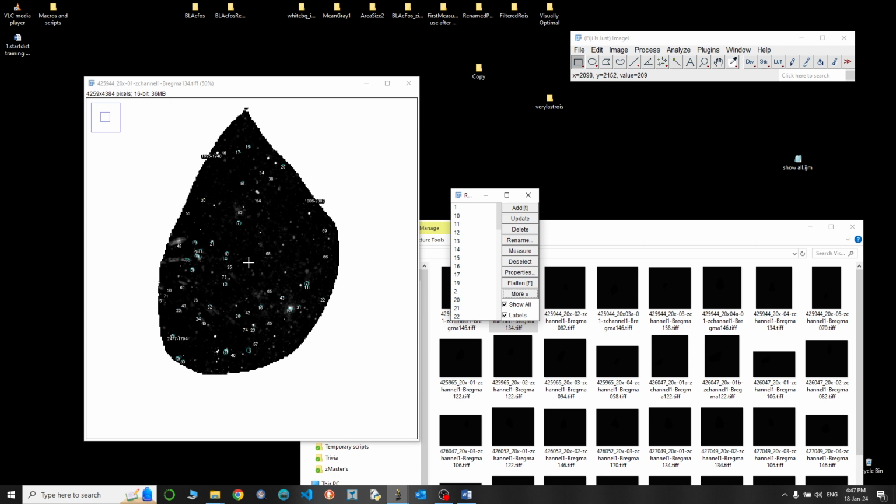And that's it. So practically after that point, the scripts that we're going to run are either just for visualization or for collecting the data, like the numbers and so on. But we have our final rows now.